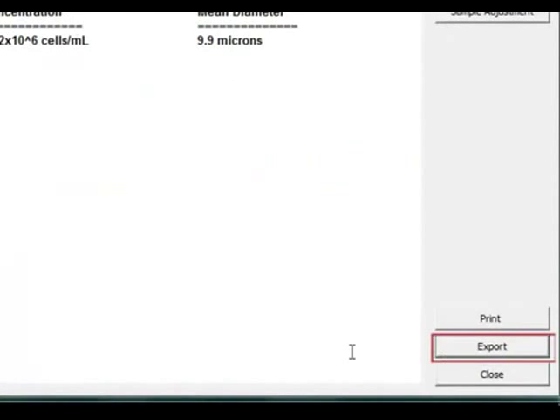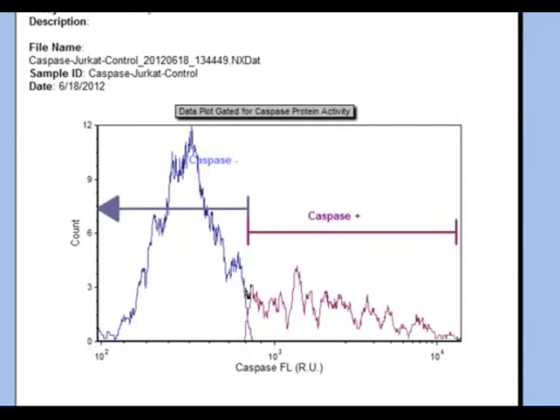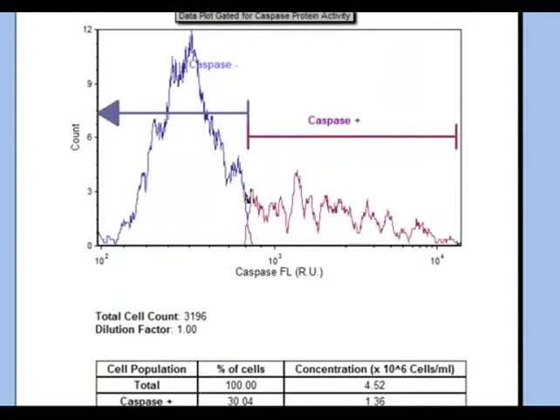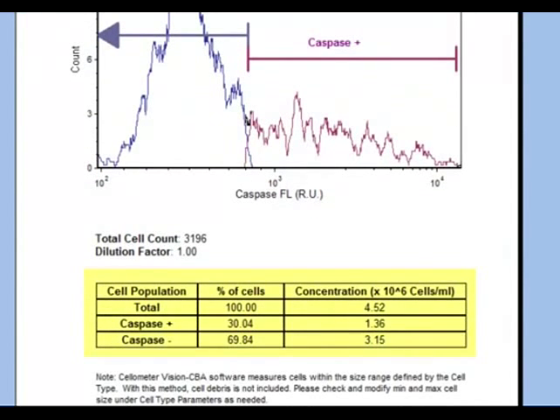Clicking Export brings up the caspase-positive, caspase-negative cell population histogram. The associated data table displays the percent and concentration of cells for each population.